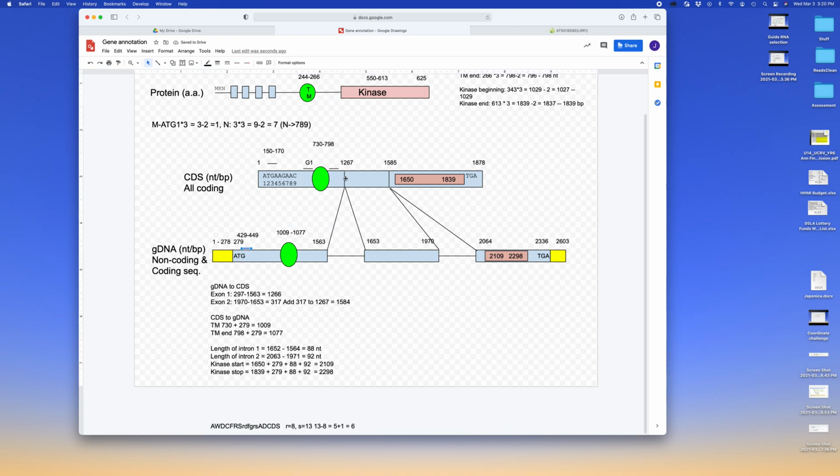And you can do the same for the others. If you do your kinase domain primers, right, like that, you would need to not only add the UTR, but the 2 introns, because the primer is going to be way down here. Okay, now we're ready to design our primers, and you can do that if you want. But definitely the first one we really need to see on the guide here.